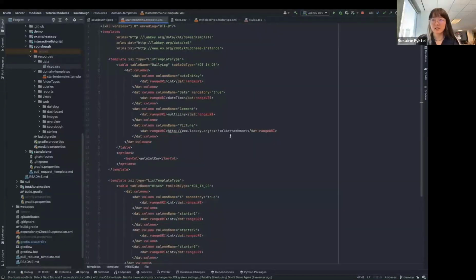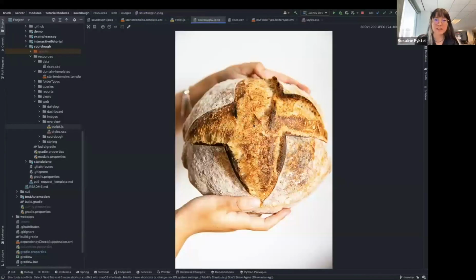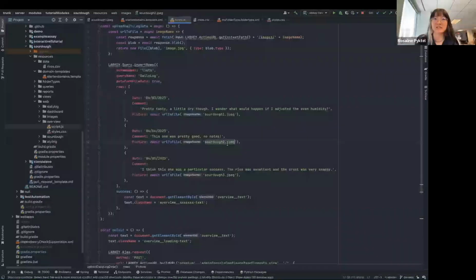This is because, perhaps fortunately for many devs, you cannot put an image in a CSV. For more complex data initialization scenarios that are not covered by a simple text .csv file, one pattern to follow can be seen here. All right, in the function upload daily log data, I'm calling insert rows with image files that point to files that are within my module.